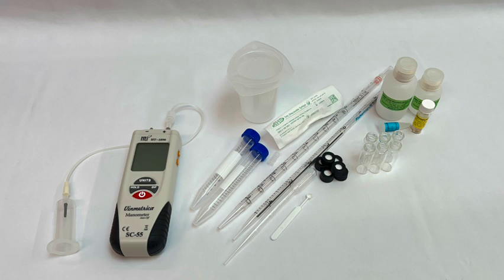You can run this assay in two different modes, either quick check mode or quantitative mode. The quick check mode is designed to give you a simple yes or no answer on the completion of malolactic fermentation in your sample.